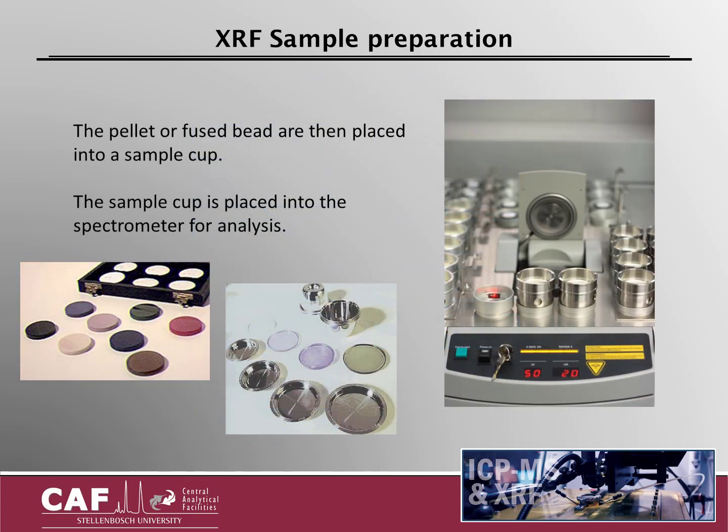After the preparation of either fused bead or pressed powder pellet, analysis can occur. The disc or pellet is placed inside the sample cup, which in turn is placed into the XRF spectrometer for analysis. With correct storage conditions, fused beads and pressed powder pellets can be used multiple times. It is thus a non-destructive technique.